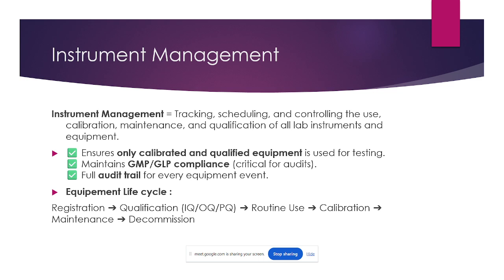And preventive maintenance is also required for each and every instrument. And if any decommissioning happens, the decommission procedure is also handled in instrument management. Once it is decommissioned, we need to remove that instrument from LIMS also. For that purpose there is a procedure, we need to follow that procedure and remove the instrument from LIMS. If the physical instrument is not available, that is the decommissioning.